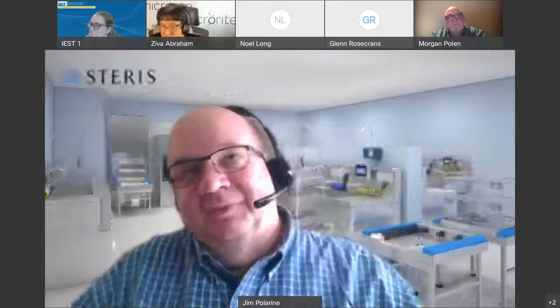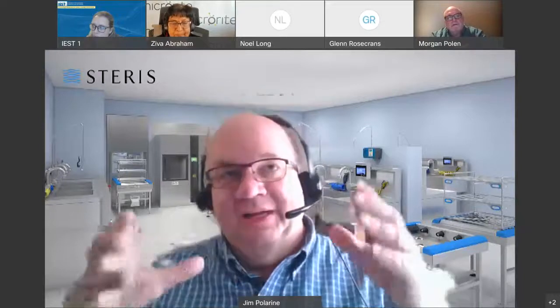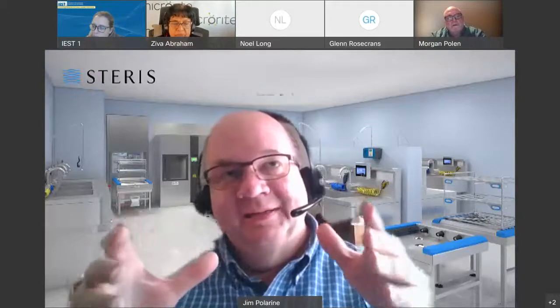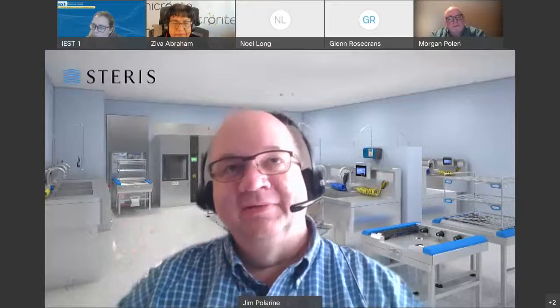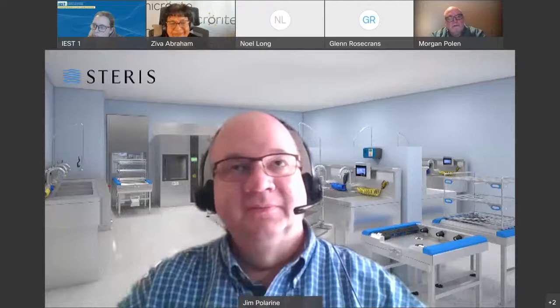Well, Ziva, I just wanted to add something to what you said that I think is relevant here. Back when I started in the industry in '99, testing was done with fungal spores in a very primitive way, because I remember looking at a readout from a site in Texas and they said, well, Jim, it says black mold, yellow mold, pink mold, and red mold. I knew I'd get a chuckle. And today, if you showed that to Thomas Arista, he'd be like, well, I think we need a little more detail than that.